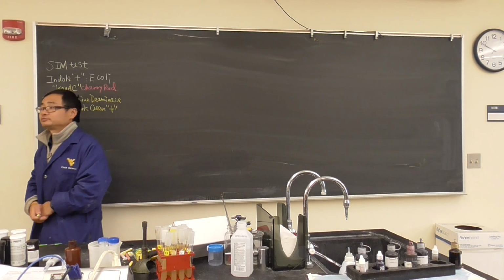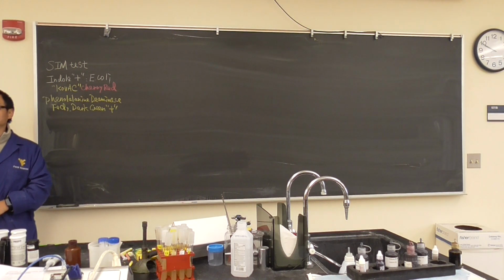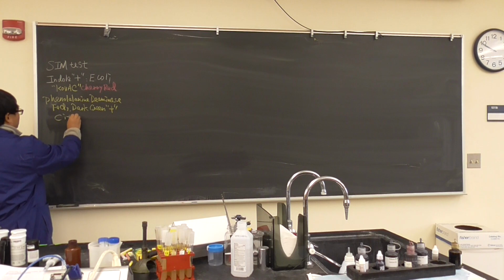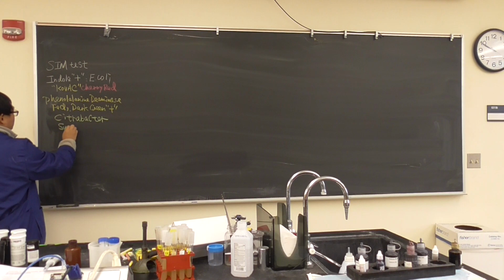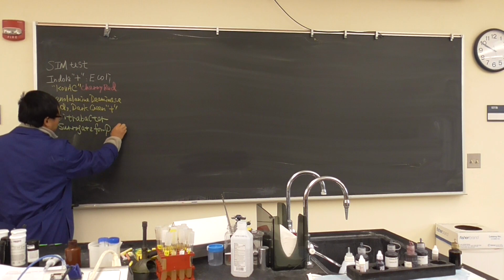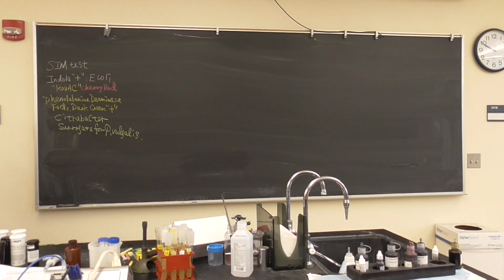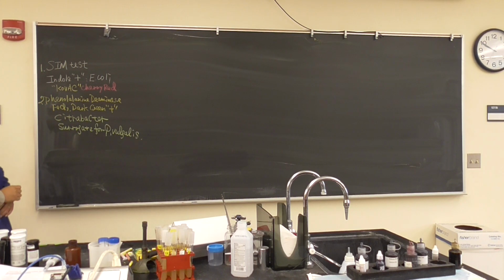Confirmation test. Then, which one is positive? Citrobacter? Yeah, citrobacter is positive. Very good. Citrobacter is positive. Okay, and we said this is a surrogate for Proteus vulgaris. So very good. Okay, these two are important previous review results, and you should record it on your notebook.